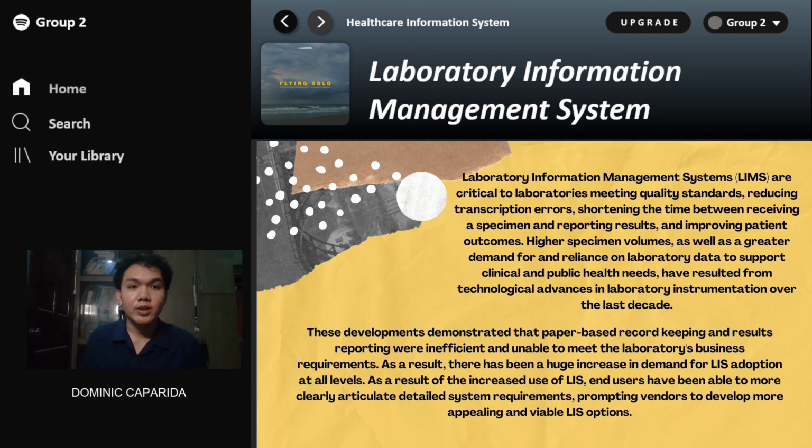It also involves technological advancements and the developing needs of LIMS software. From traditional means of paper-based recording of results, we are now in a digital age, and there are a lot of advancements in technologies, especially in the clinical laboratory, where there are a lot of new machines that can be used by medical technologists and other staff and personnel in the laboratory that can make their work easier than doing manual work.